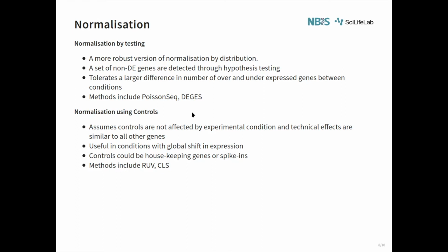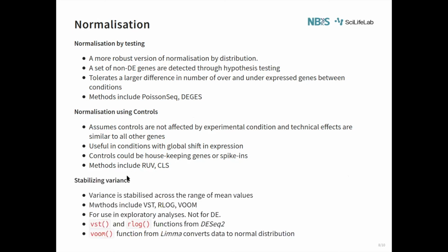And yeah, you can also use spike-ins for this, and you can provide spike-in counts as the normalization, so it plays a part in your normalization factor. So this is another possibility, but then again, it depends on the particular situation in your experiment if you have this. Again, you need to be really sure that your spike-ins are behaving the way you expect them to, because spike-ins are not perfect. It's very hard to measure exact, very precisely equal volumes across all your samples. So there are some practical issues to that as well. Yeah, so that is about normalization.